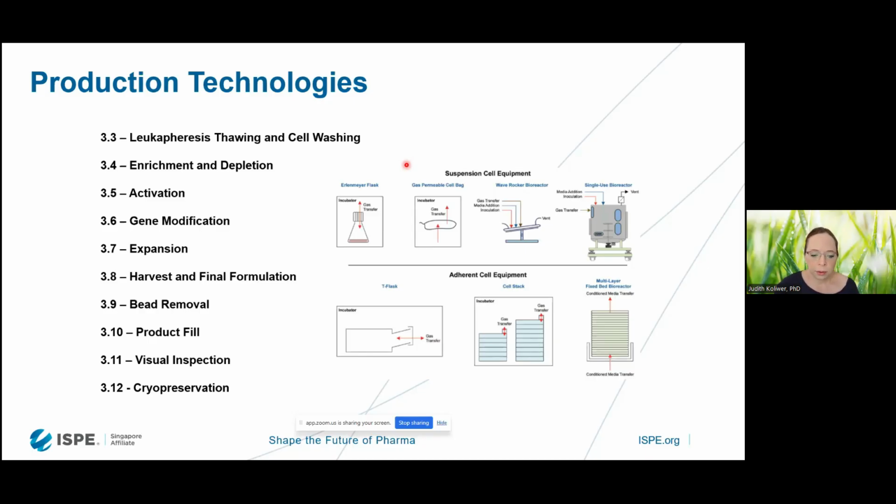And then also, let's say, the level of sophistication. So between equipment that allows us to do one washing cycle and equipment that allows us to use different washing solutions and different washing cycles, really, we are back on the program definition. That is something that we have seen with the cell washing process. Of course, there are also possibilities to include the cell washing in a cell processor, but I will come to that in a moment. More or less, we are really seeing our cell washing cycle as tabletop equipment.